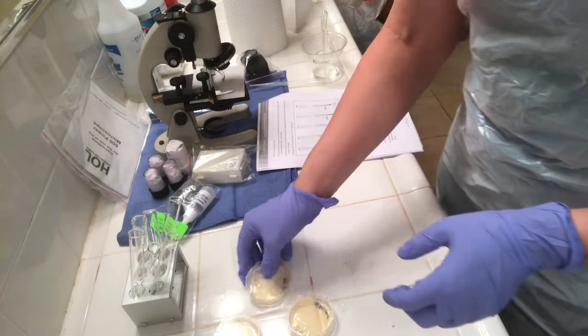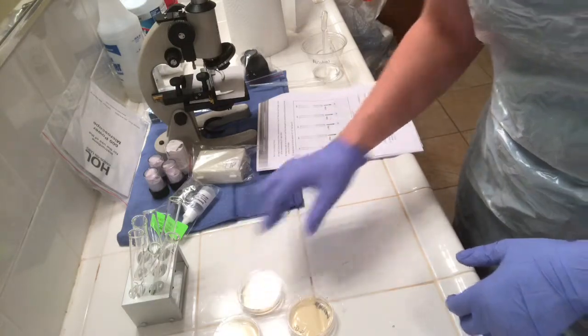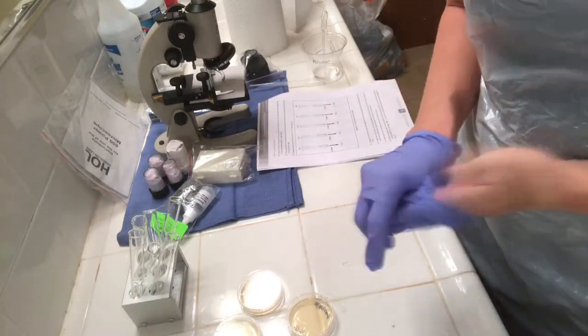And then I will be leaving it upright for 12 hours. And then I'll be incubating it for an additional 36 hours and continuing this video.